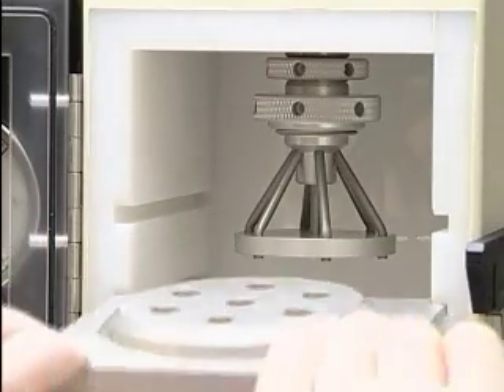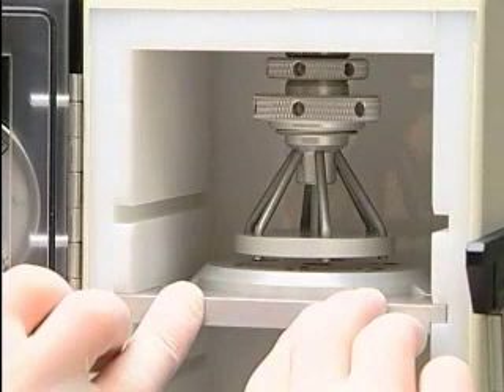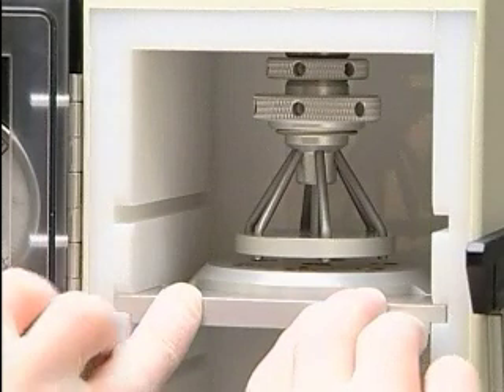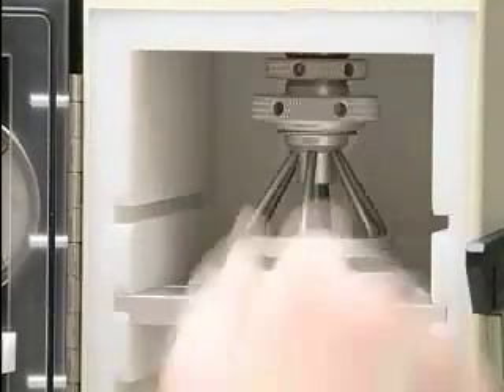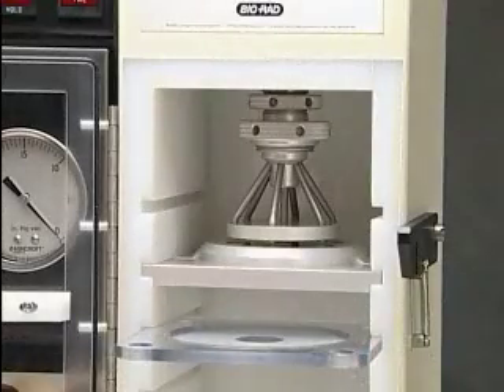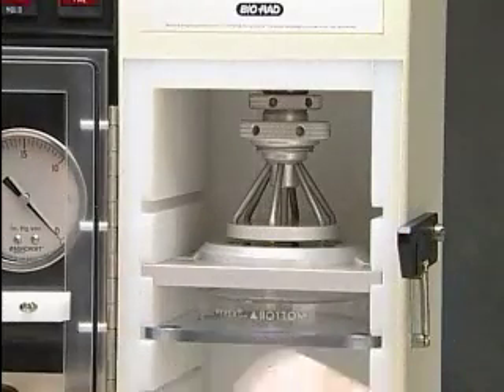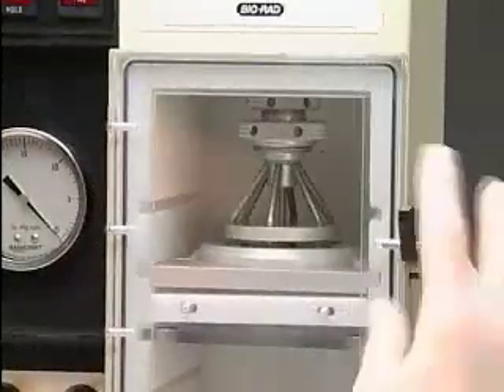Loosely screw the top of the seven-arm gas divider into the parts already inserted into the chamber. Slide the macrocarrier shelf assembly into the second shelf position with the seven holes of the macrocarrier holder facing up. Line up the seven pressure outlets with these holes and tighten the lower ring. Place the sample on the target shelf, then close and latch the door.